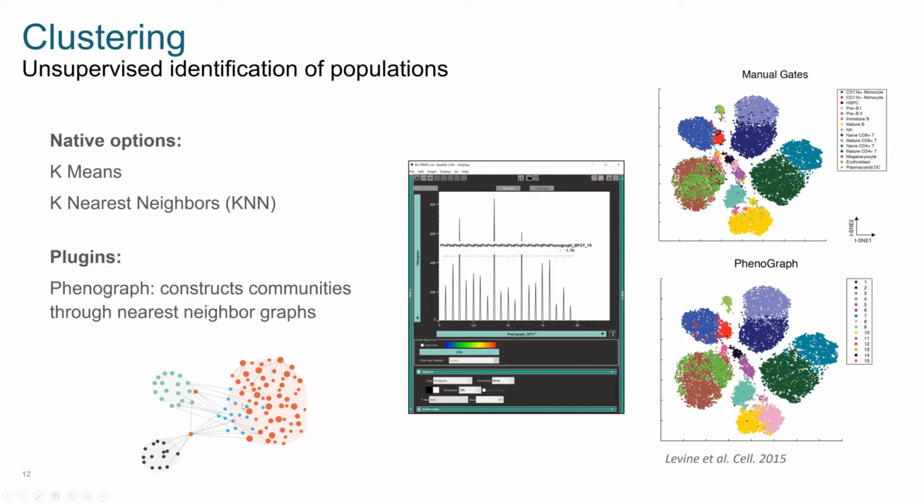So this can be visualized here, where if you had all your events in a high dimensional space, they would all start being separated by similarity in terms of their transcript profile, or if you have a multi-omic experiment in terms of their protein profiles. And then, we're going to code them into different populations and make those subpopulations.